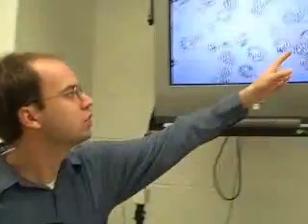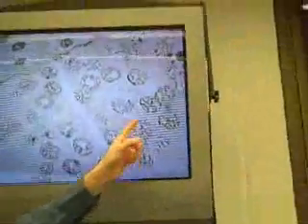These grasshopper cells are in prophase 1. In prophase 1, the double-strand chromosomes, that is the dyads, will line up, forming tetrads, and the tetrads will undergo crossing over, so they'll swap arms of the chromosomes. So you can see you have lots of tetrads forming here. These tetrads are undergoing crossing over.